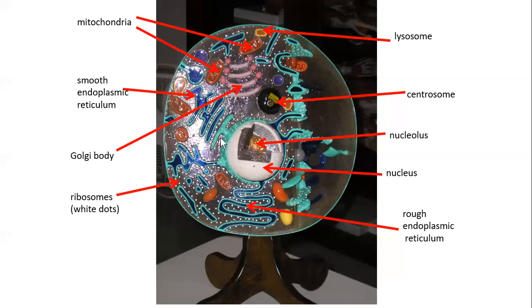The second large region of the cell is the nuclear region. You see 2 parts here. And the second item in your lab report is asking you to compare the function and the composition of nucleus to that of the nucleolus. So nucleus is much larger, spherical component.